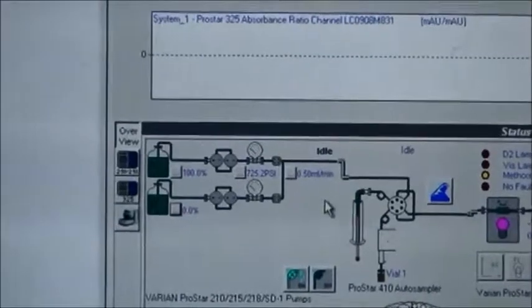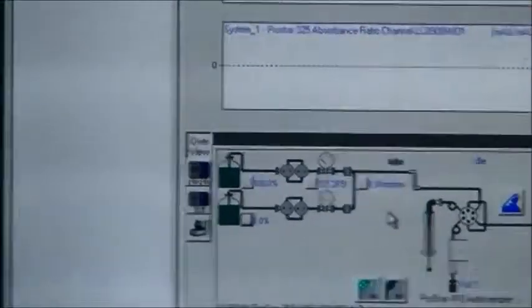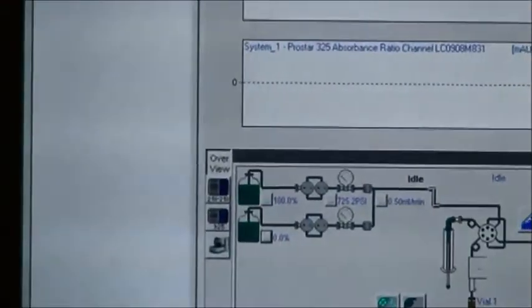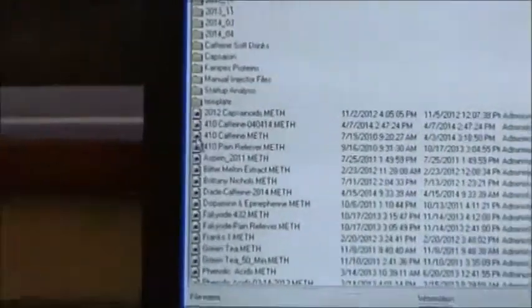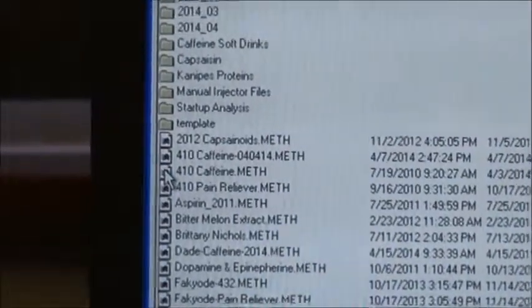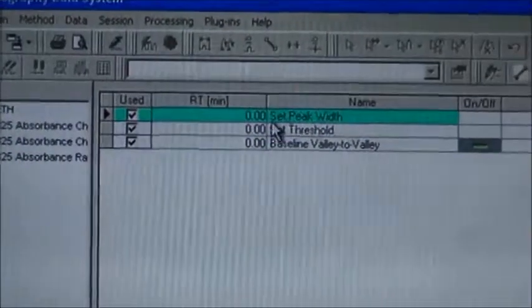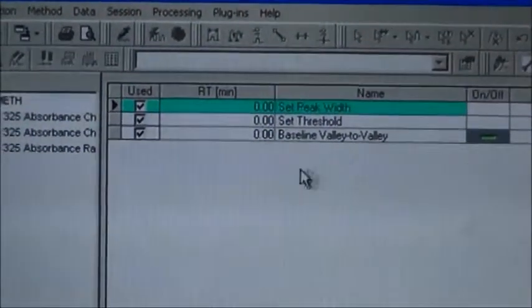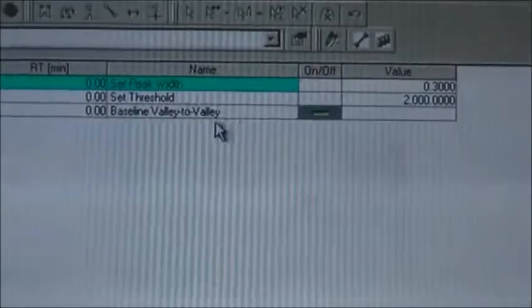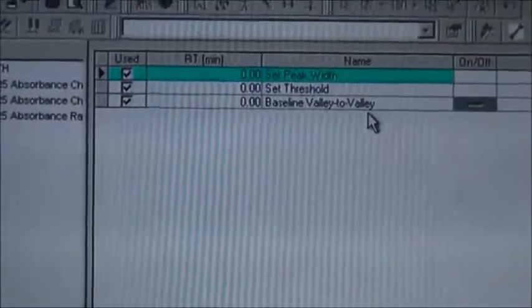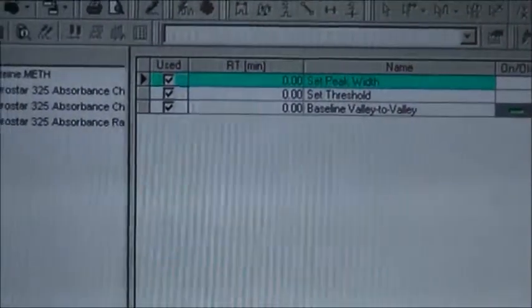The other two things we need are our method file and our sequence file. I'm going to go over here to open my method file. I didn't have enough time to go through how to create a method file as it takes a little longer, so I have already prepared one. It shows the peak width, threshold values, baseline values — everything is set in the method file.